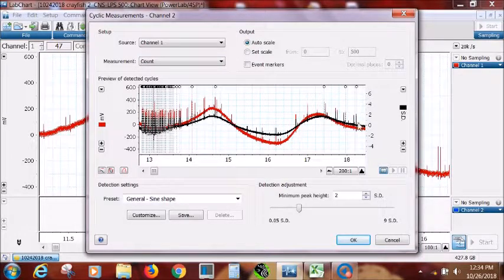And then down here you see these 2 traces. The black bar gives us a standard deviation of our trace, and you can see what it's counting. There's little circles up here at the top. That means it's counting those spikes. But look, we're missing that one, we're missing that one, we're missing these and here. And this is because the baseline's moving up and down.